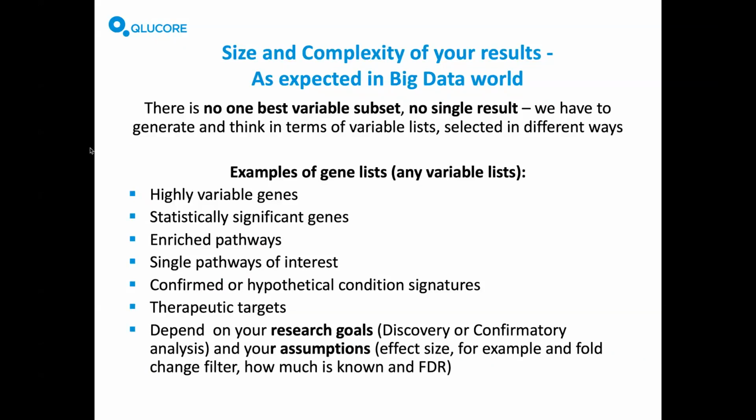And we give you some aid and guidance in Qlucore to make you feel confident and evaluate them before you choose what you will decide as your final result. And of course, iterative analysis, you can always go back and reanalyze and compare your results. Maybe you will be merging different experiments together into a bigger data set. So this all is possible.